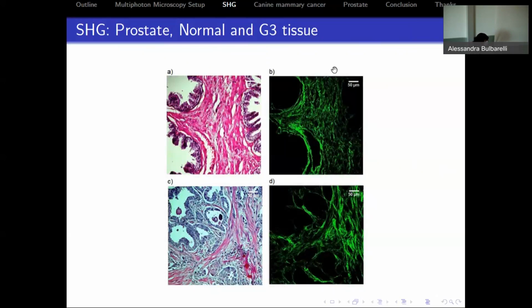And so this first example that we did is a prostate cancer. The top one is just the normal tissue in an HE cut, the same idea as is used by the pathologist to do the visual histological diagnosis.